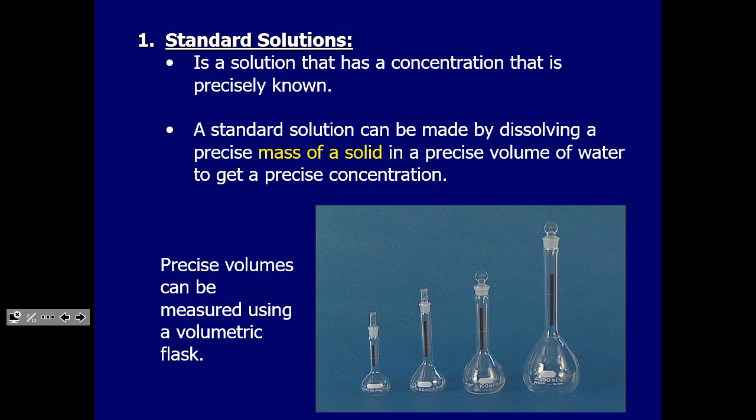So we can get masses very, very precisely. If you want a scale with 5 significant digits, though, it costs you tens of thousands of dollars, like $50,000 for a very precise scale. Our scales with the 3 digits, they're about $450 to $700. It depends on when we get it and where we get it. So they're fairly expensive as well.